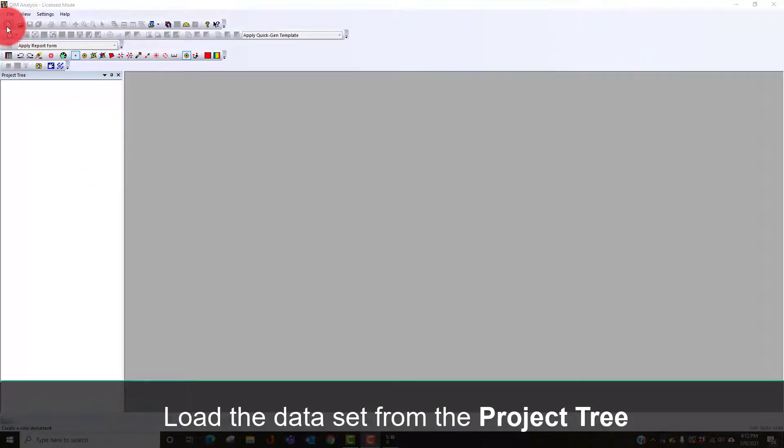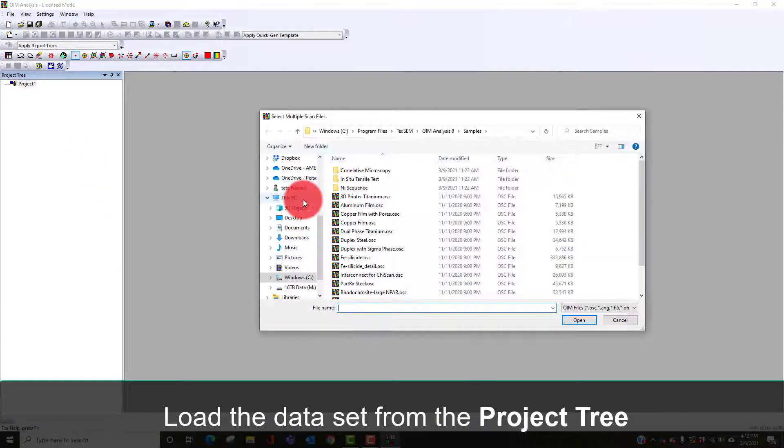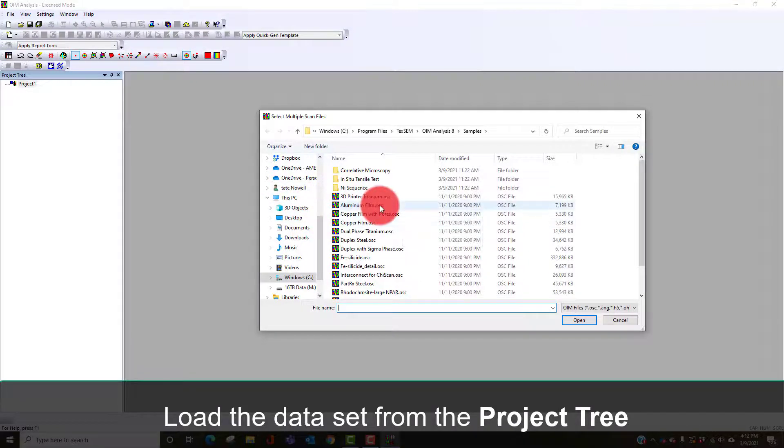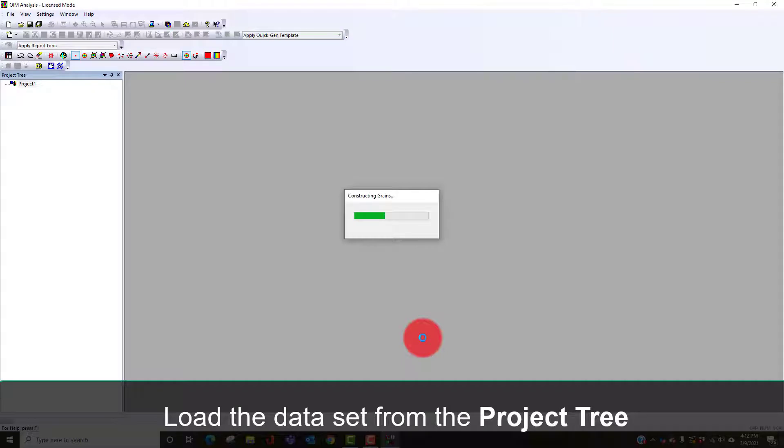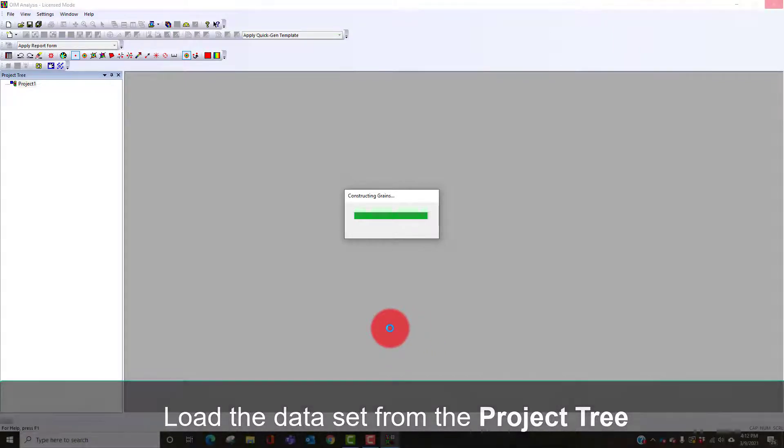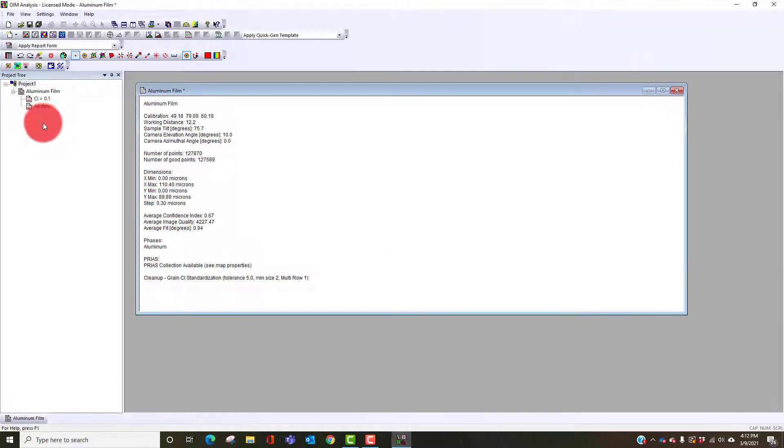In this video I want to show you how you can use OIM analysis to quickly and easily look at the grain size and grain structure of the material. I'm going to load this dataset, an aluminum film. When we load the dataset it's going to create a high confidence partition.